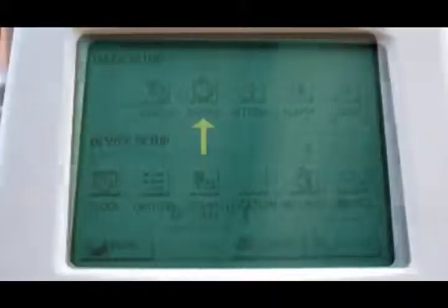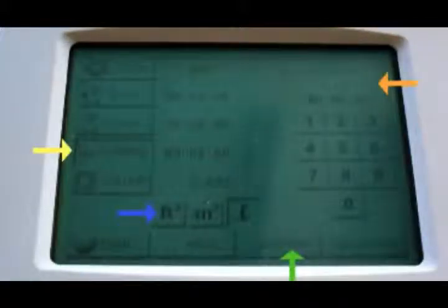Select the sample button. Here you can set your sample event parameters. The important things to select in this screen are the sample interval and volume setting. If you select the sample button, you can adjust how often it records a data point. Generally, you will set this to 1 minute. This is an averaging period. Every 1 minute, an average is taken and recorded.